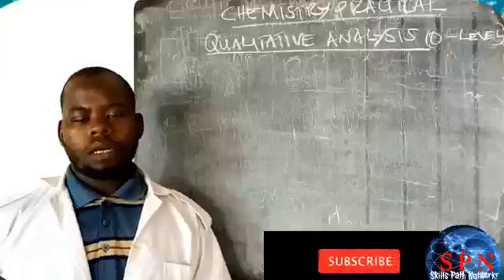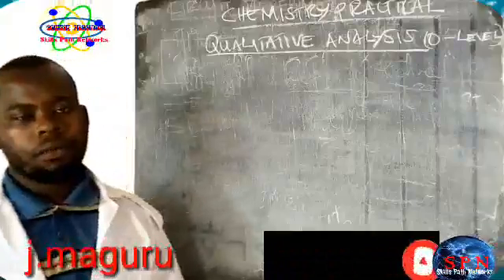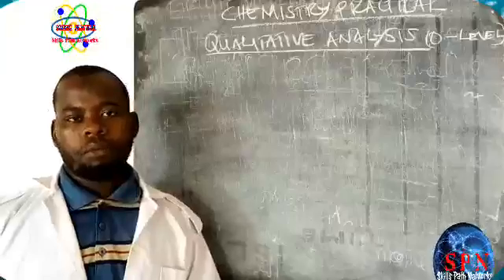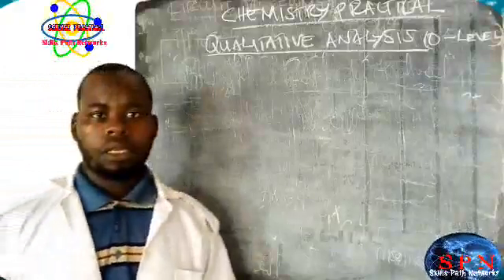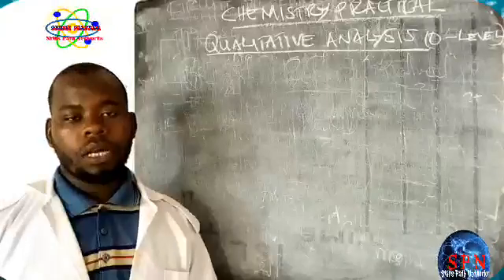Welcome to our chemistry practical session. We are here to resolve the challenge within practical subjects: chemistry, physics, and biology. Today we are going to look at qualitative analysis at ordinary level.